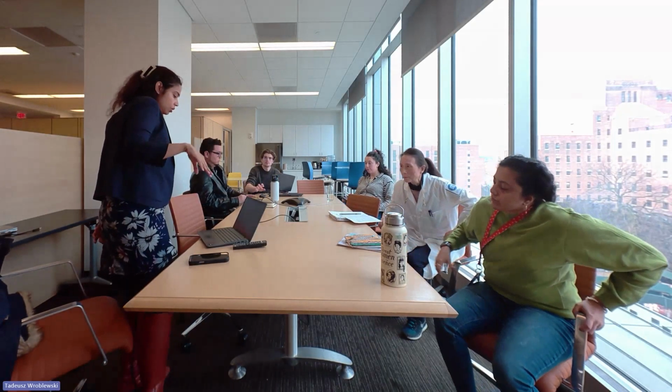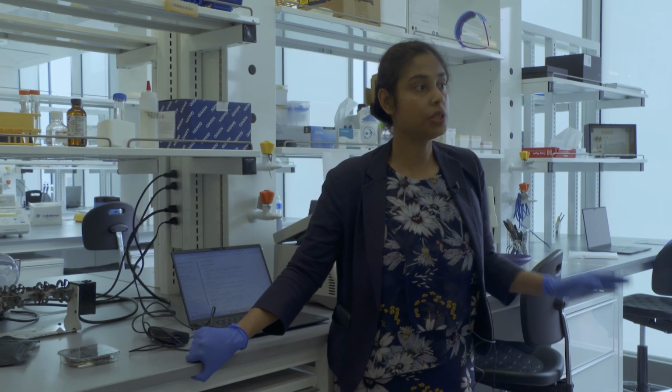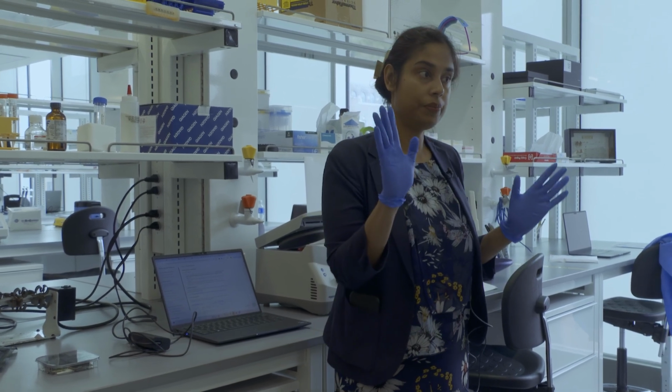Once we start pooling all the reagents, we can figure out which samples we want to pool. We do have a KB document for the base calling. I am going to share that with you, but that document is more towards other platforms because there we have a fixed computing part. It says, for example, whether you can do 2 SUP calling at the same time, or whether it has to be run in fast mode or HAC mode.